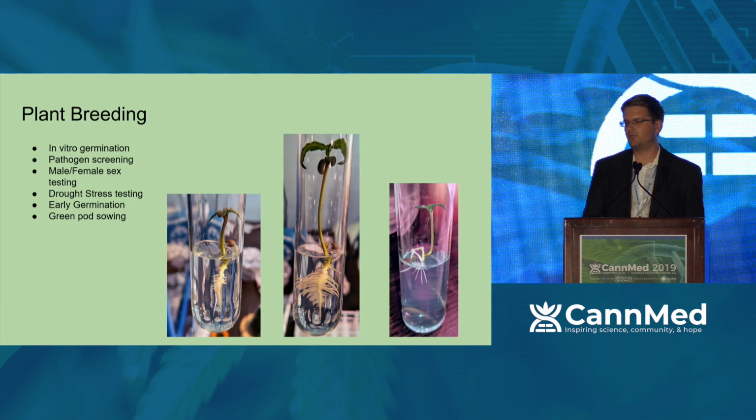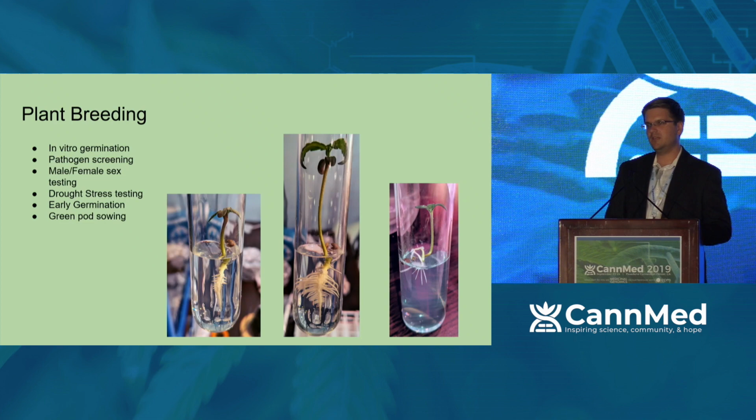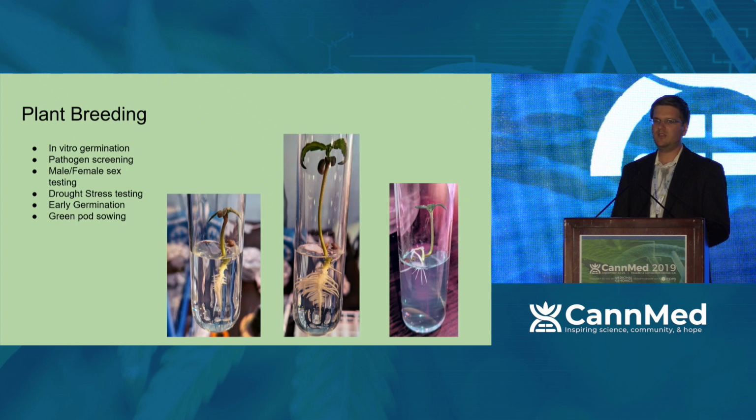The other one is green pod sowing, where you can pollinate a female plant and wait a week until the seed starts to develop. The embryo develops first, and then the seed coat develops around the embryo. When you pull the seed early and the embryo is developed, you can put that in culture and grow it out, and you can cut months off your breeding cycles every generation because you're not waiting for a seed coat to develop with all the nutrients, hormones, and vitamins the plant needs in order to grow and keep it alive within the seed coat itself.